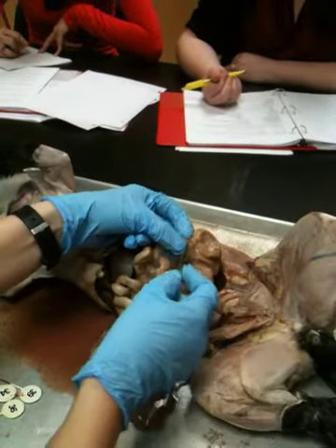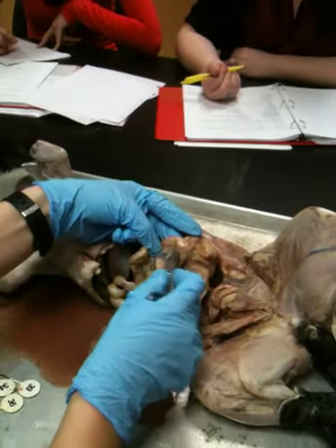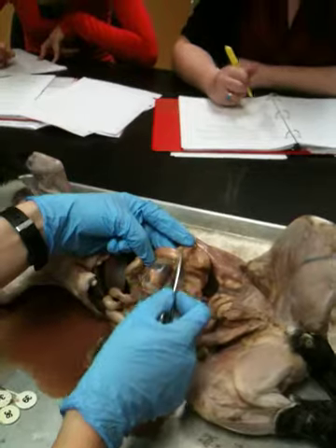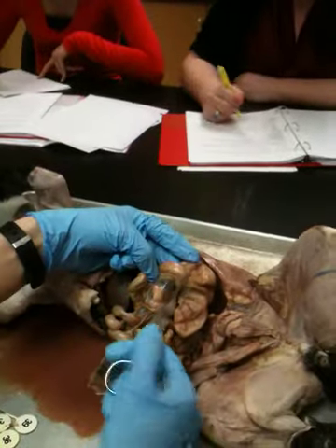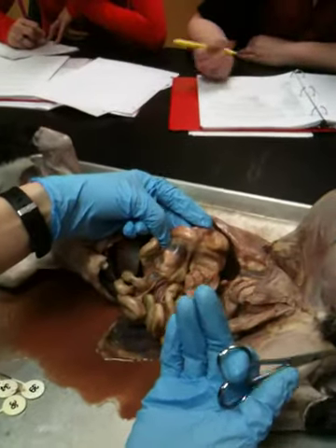Okay, so then you'll see that the small intestine kind of junctions not at the bottom again. So it's going to junction at another sphincter point, and that is called the ileocecal valve because the last part of the small intestine is ileum, and the first part of the large intestine is cecum, so that's the valve that separates the small from the large intestine. And that one is evident on that cat over there. We got it open. And so it should look like a butthole because it's another sphincter. All your sphincters should look like buttholes because that's what anus is.